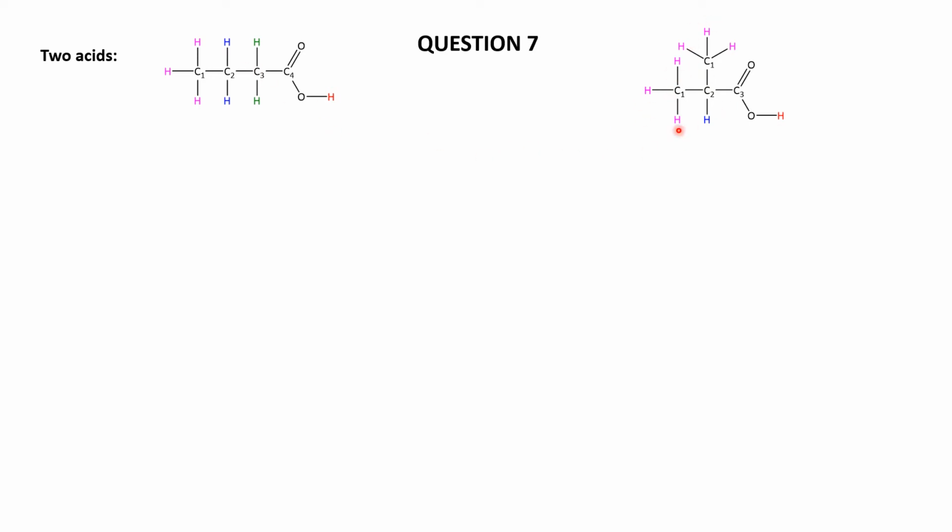Okay, so 2 acids, going to be fairly easy to distinguish them because one acid has got 4 carbon signals, the other one's got 3 carbon signals, and when we look at the hydrogens, you can see that we got 1, 2, 3, 4 hydrogens expected for the butanoic acid, and then 1, 2, 3 types of hydrogens expected for this isobutyric acid. And then the other lovely thing with acids is that, as previously mentioned, the proton of an acid group is very, very high shift, very, very far downfield. So let's look at the proton spectra that have a very, very high field proton.